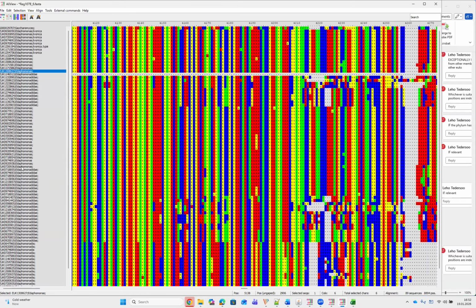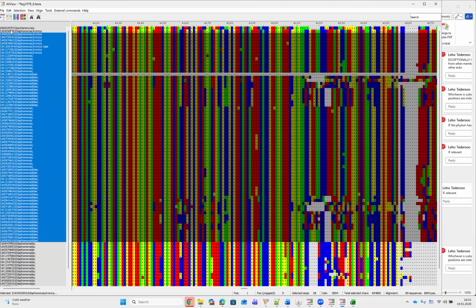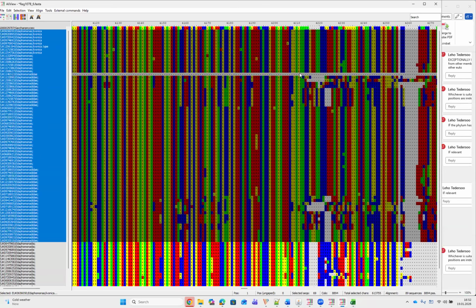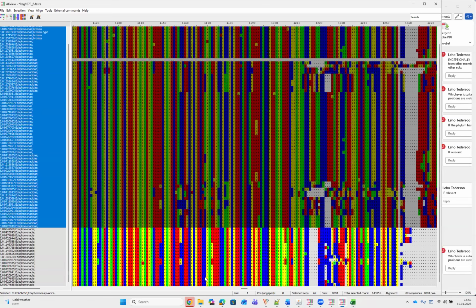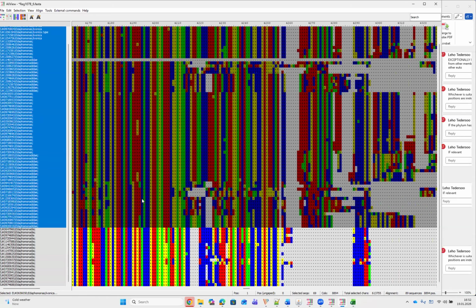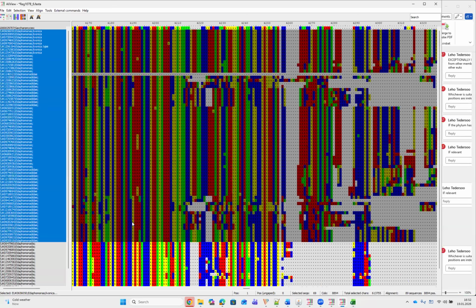Now we have the family. So it's all this group that we have to compare to anything in the bottom, but also Saccharomyces and other eukaryotes. So can we find some good distinguishing region, at least a candidate?